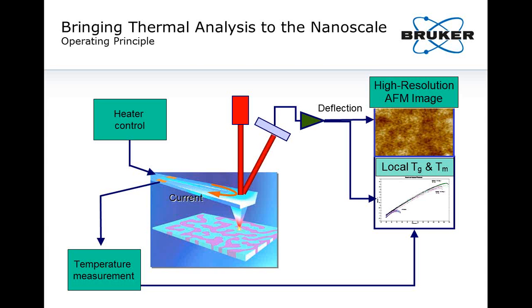The deflection of the probe is of course being monitored. As the sample heats, it expands, pushes the probe up, deflection increases. That's that rising line in the graph on the right side, until the sample starts to soften and the probe starts to plunge down, at which point the probe is then withdrawn to avoid burying it in the sample.